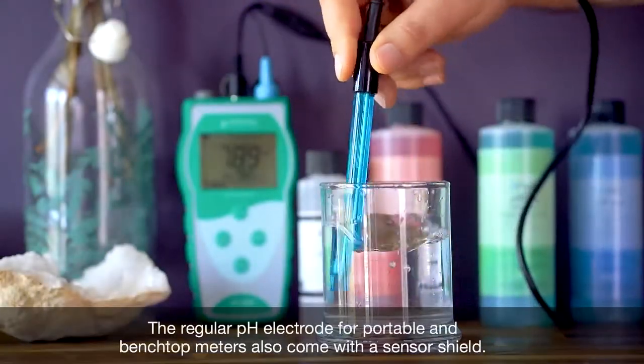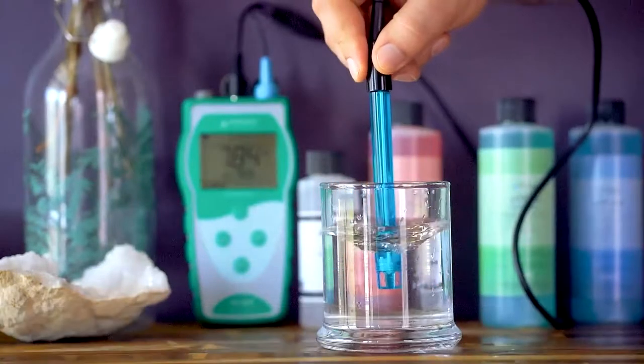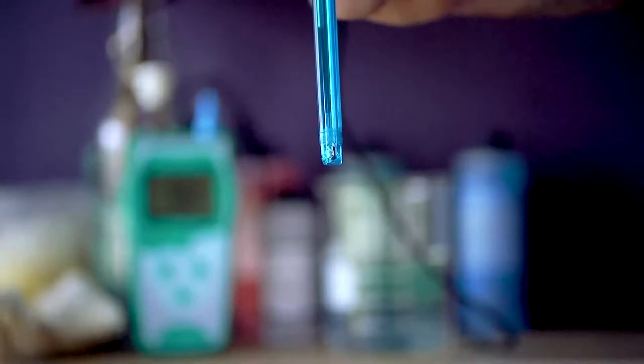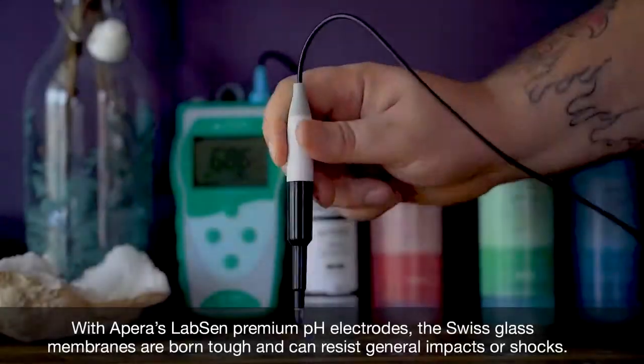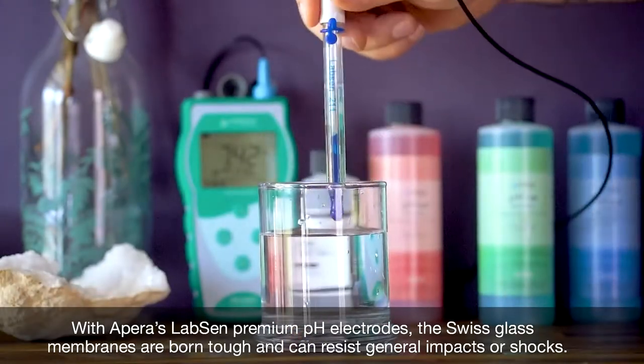The regular pH electrode for portable and benchtop meters also comes with a sensor shield. With Apera's LabSen premium pH electrodes, the Swiss glass membranes are born tough and can resist general impacts or shocks.